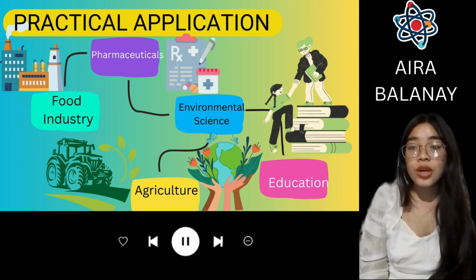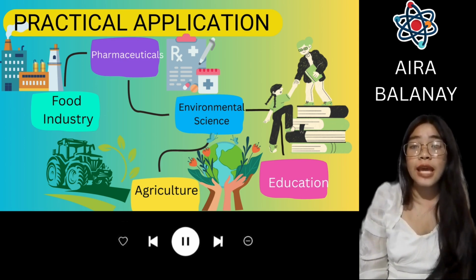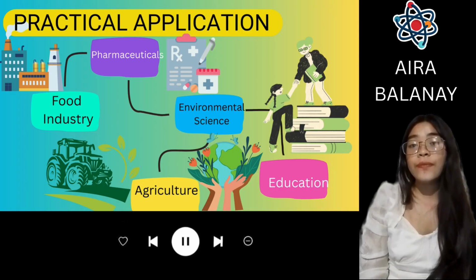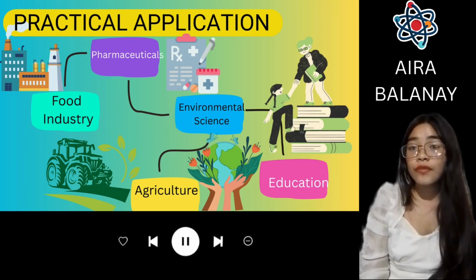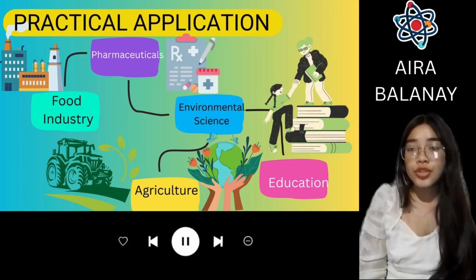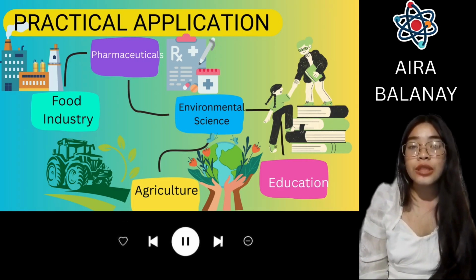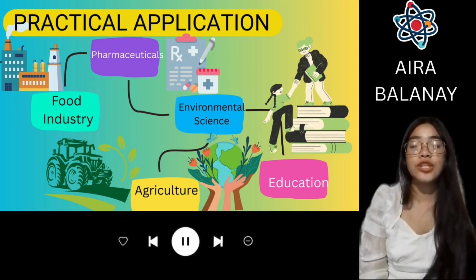It is done in a mixture of ethanol and water using standardized sodium hydroxide as a titrant. The titration can be performed visually using phenolphthalein as an indicator, or potentiometrically using a pH electrode. This method is simple, rapid, and sufficiently precise for quality control purposes, ensuring the potency and the safety of this hypertension and heart failure medication.